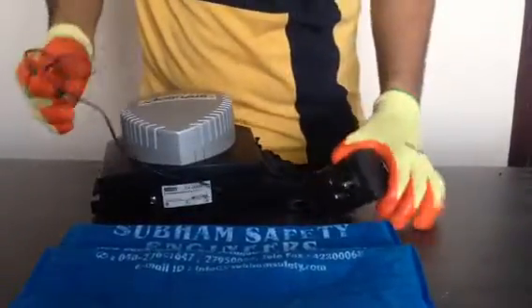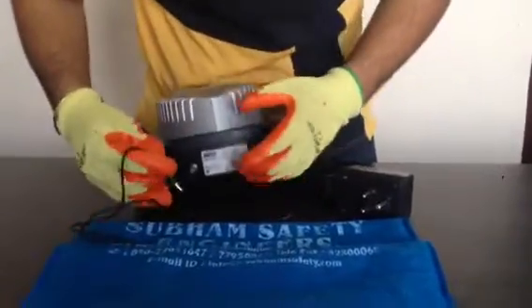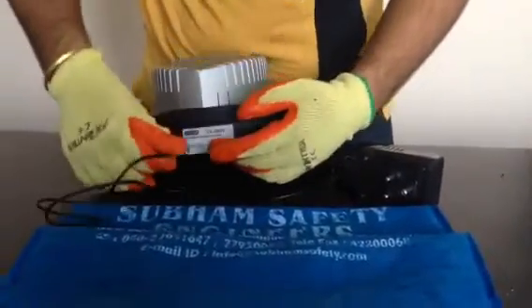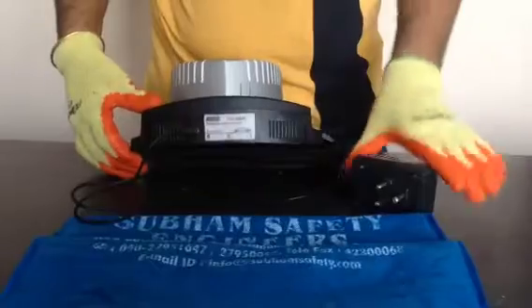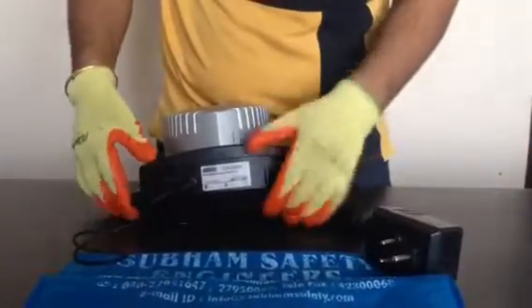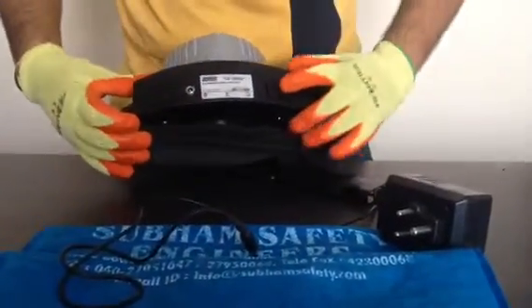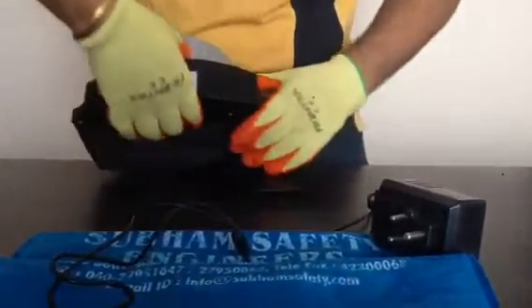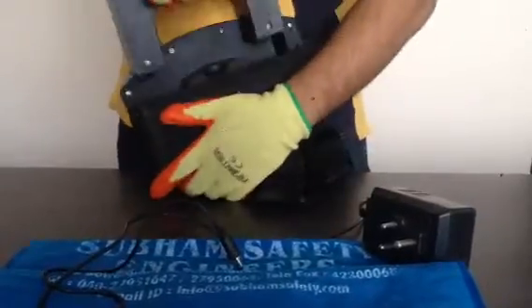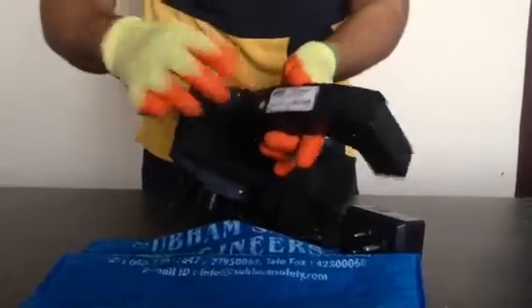Hi, for charging the PAPR of Venus Clean Air, we can either plug it into the socket over here and put the device on charging using a normal 230 volt socket, or alternatively we can remove the battery pack by sliding it this way and plugging out the battery unit, and then it can be charged outside as well using this device.